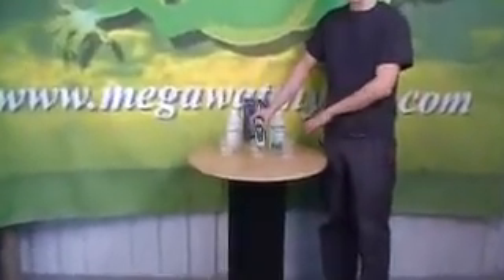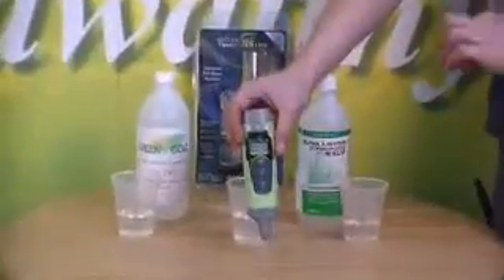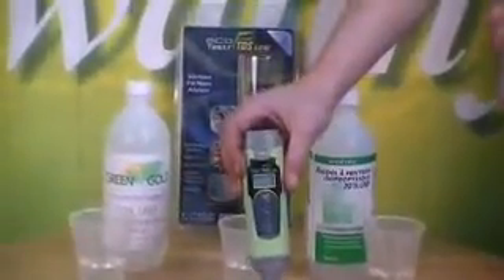First you gotta rinse it, then put it in your alcohol for 5 minutes — not more than 5 minutes. I stress that because you will burn your electrode.